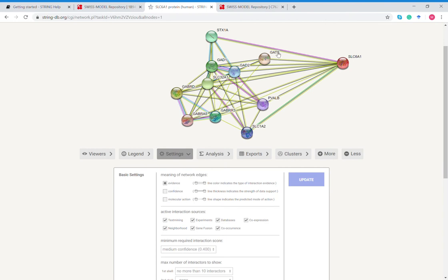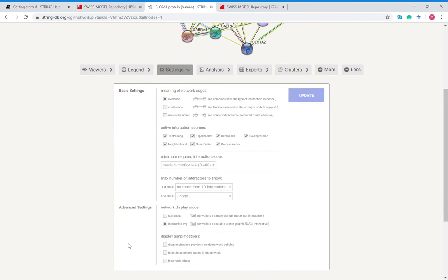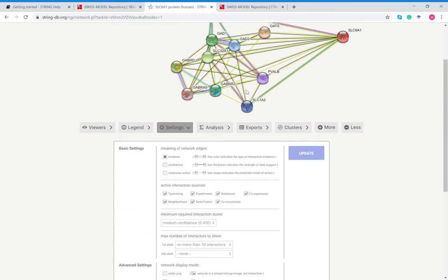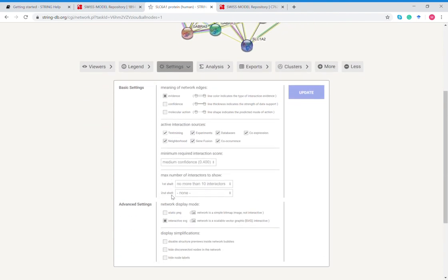You can change some things around, so you can change the lines by evidence, confidence, or molecular action. Confidence just shows you if the line is darker or thicker, it's more level of confidence that protein interacts with a different protein. Then molecular action, the line shape indicates predicted mode of action. This is all the resources that it is modeling this protein after.